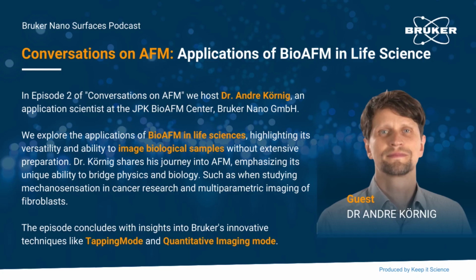The last one is the huge development in how easy it is to use the system. I guess this happens with a lot of techniques, but when I started, it was the geeky physicist who did his whole PhD with the system. Now it's more and more that just anybody can get a measurement out of it. I think this is the development that fluorescence microscopy took maybe 10, 20 years ago, where before you needed to adjust your wavelength and know what's going on. Now people just press a button and want to have their GFP.